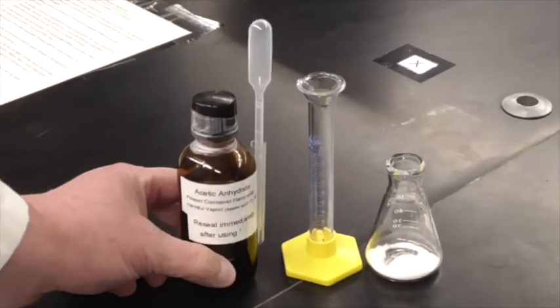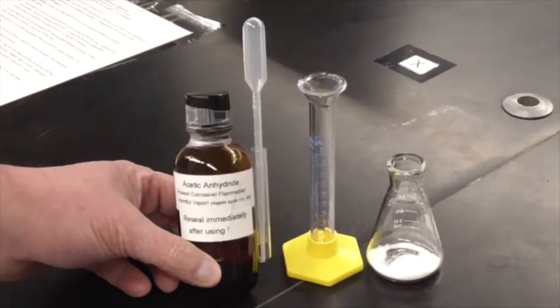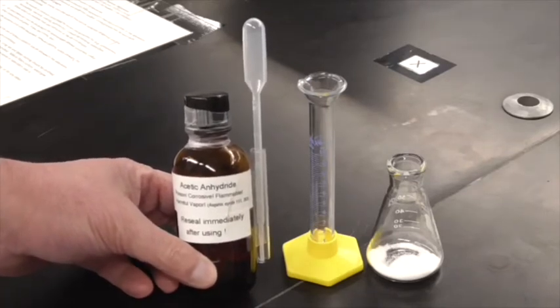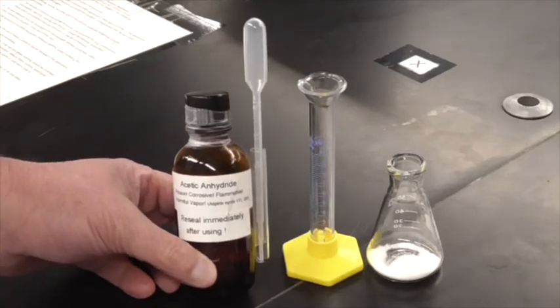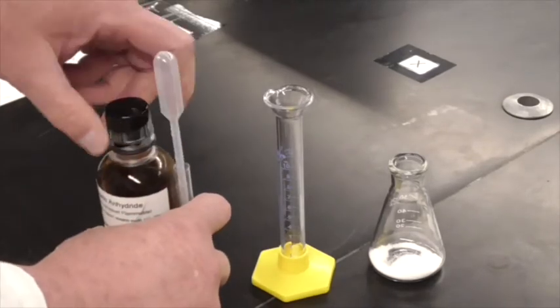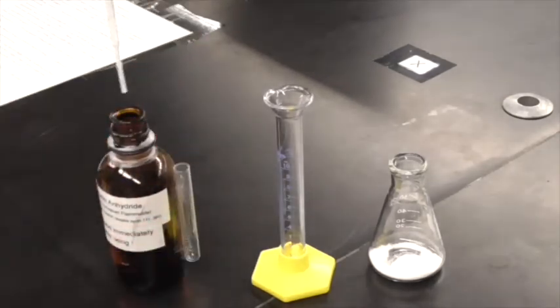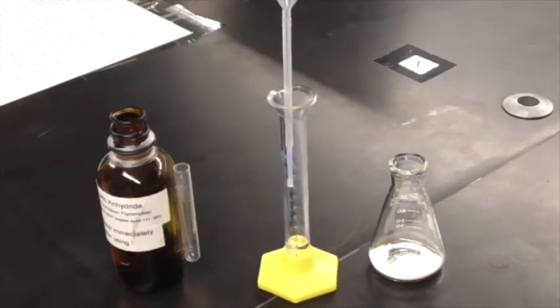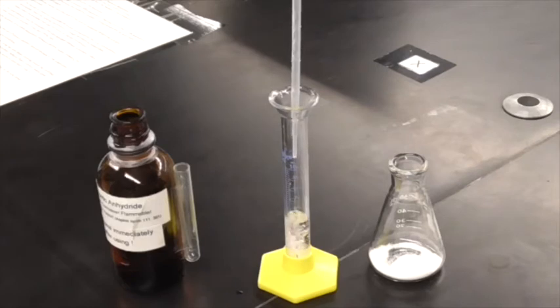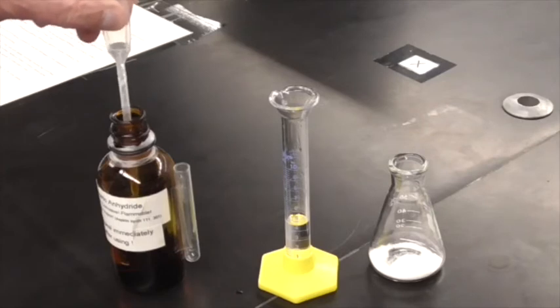Alright, so here we are. We've got acetic anhydride, and we need to add 5 milliliters of this and dump it into our salicylic acid. So I've got a graduated cylinder here. I'm simply going to add, to get 5 milliliters. It's a little bit over 2. Just a little bit more.